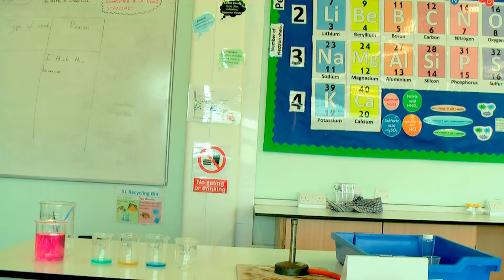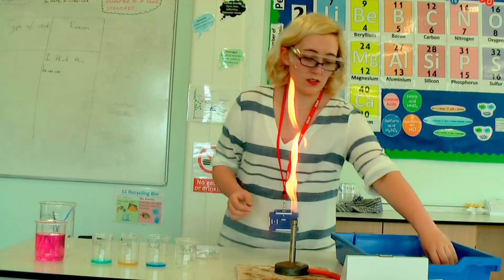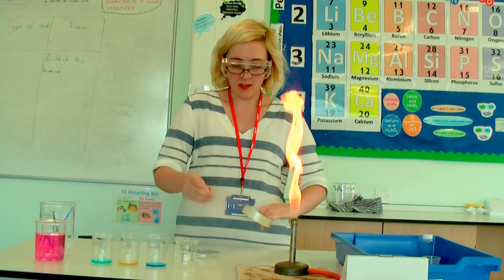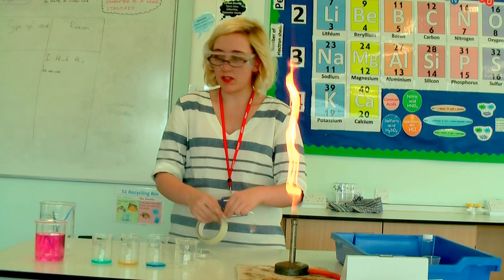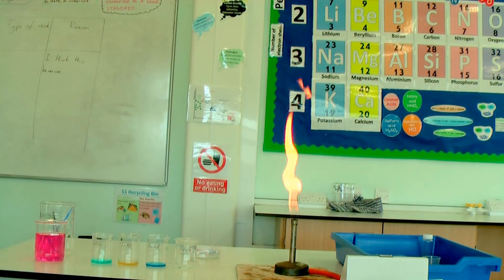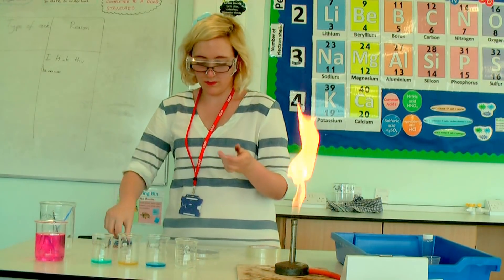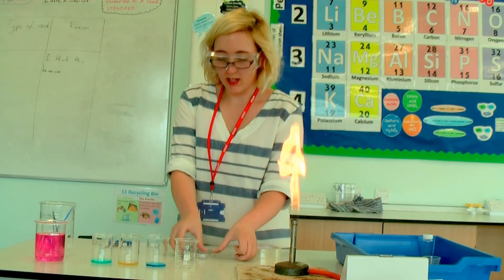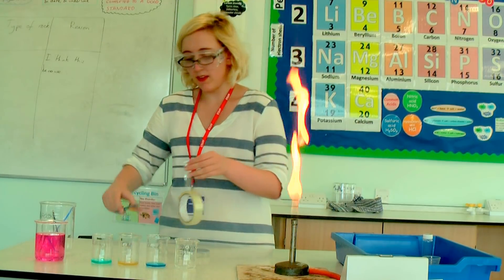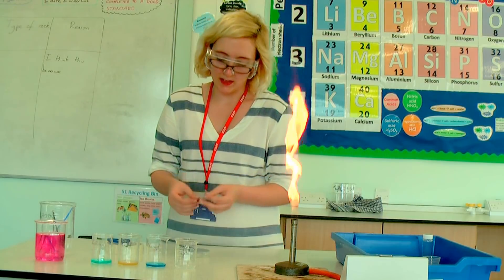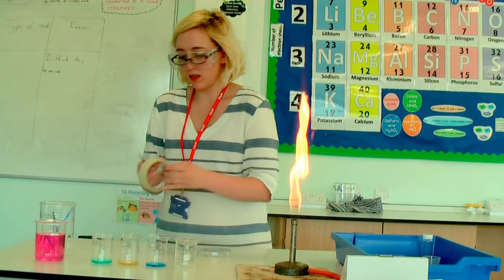Now I have my four discs on the E. coli plate. I need to tape it up — I've got some sellotape here. You do not want to tape all the way around the edge; you only want the tape to go in four sections, like a cross over the top. If you tape all the way around the edge you won't leave any holes for air to circulate, which can cause the growth of anaerobic bacteria, which can be dangerous. So we just tape it across the sides.